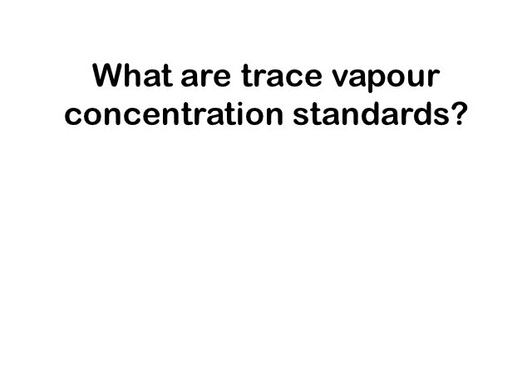One common and important example is in calibrating chemical analyses by instruments such as mass spectrometers, gas chromatographs, or a combination of the latter two, namely gas chromatograph mass spectrometers, GC-MS.